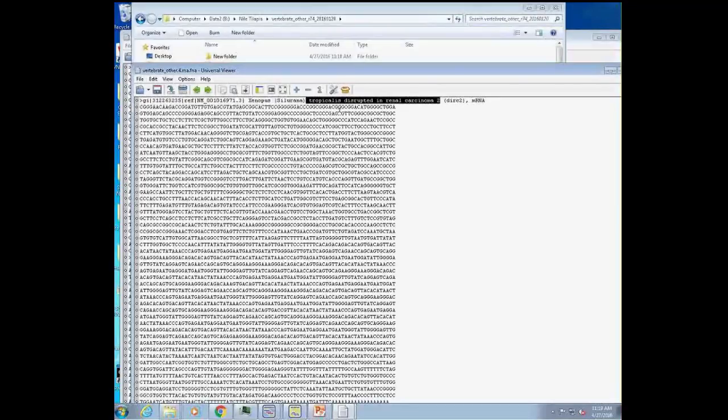This varies quite a bit within the database, so keep that in mind. If you are using this database, or if you have another database of reference sequences, the software is designed to parse out this information from the header and pull it through so that we can load it into our analysis downstream. So it is this part that's key. And again, this is from RefSeq, so our software is hardwired to pull out the relevant information. But if you have another database, this header probably will be different, and that's where we can help you extract that information and pull it into your analysis.